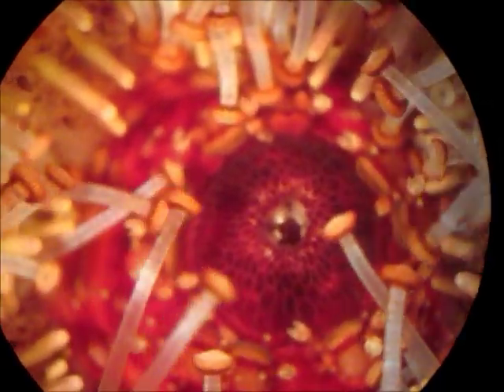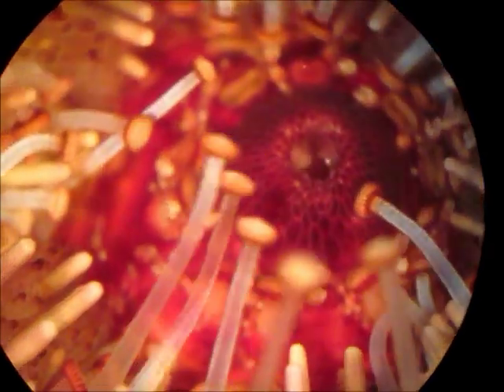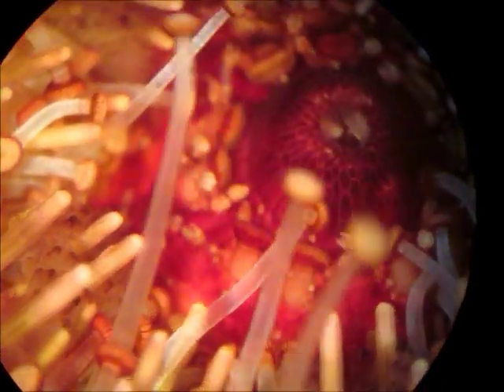It's pretty cool just to watch it. It's pretty wild in the middle of a microscope. I could really just sit here for a while and just watch.